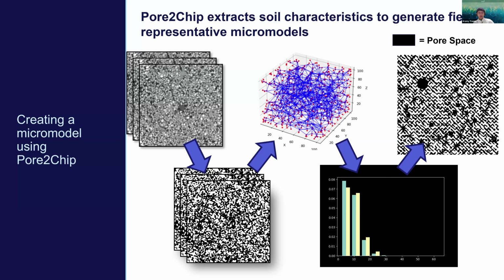Yeah, that was something that I had talked to my team about back when we were first prototyping PortaChip, and it is pretty complicated because of how we're making this scaffolding, as you saw, for the two-dimensional network. We're essentially making a lattice where we can control the positions of the pores and their coordination number connectivity.